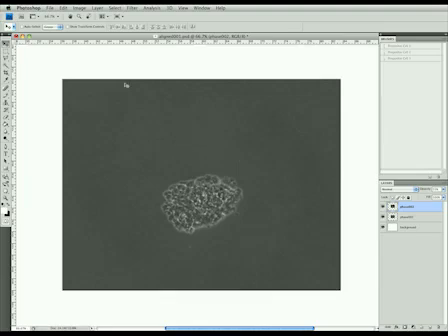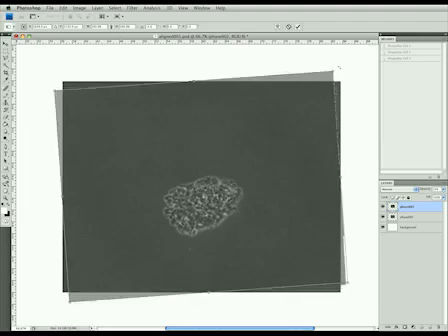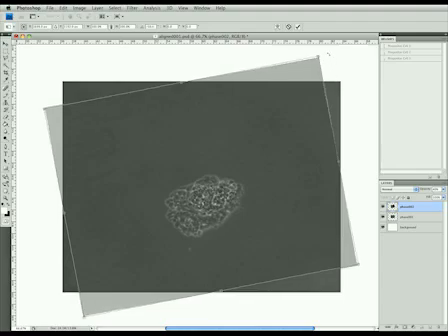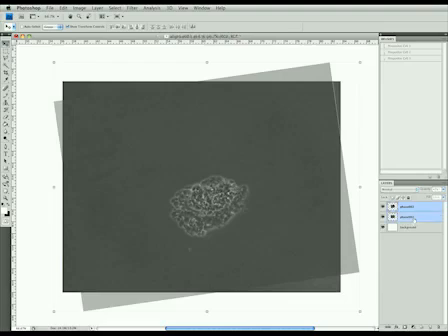Under the Image tab, open Image Rotation and choose Arbitrary. Rotate the second section until you are able to identify points of geometric and structural contiguity between images. Repeat for all serial sections, saving each section as a separate layer. Ensure that each image layer corresponding to phase and protein expression are linked so that all rotations for each channel are performed at the same time. Create a plane in Maya that is of the same proportions as the Photoshop file.